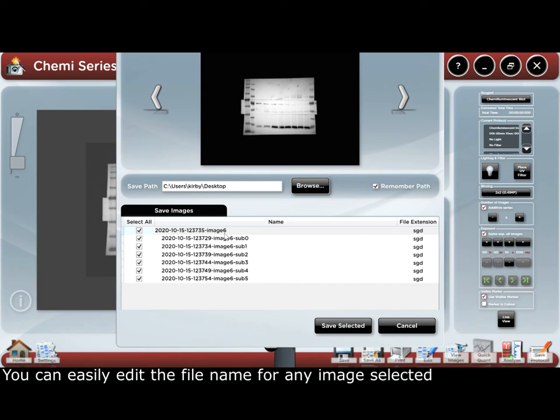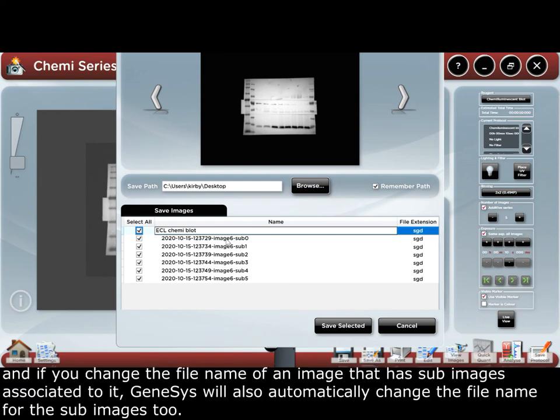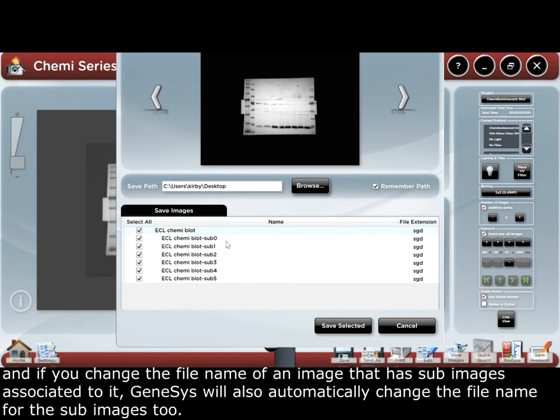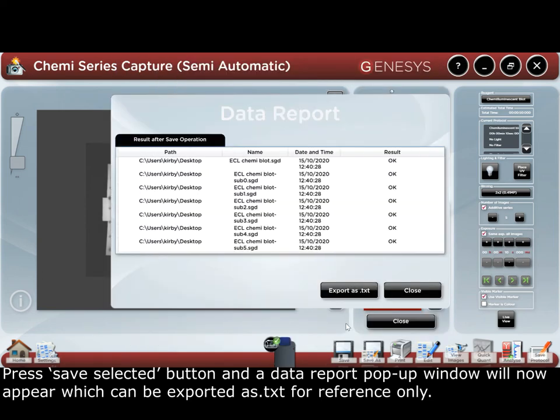You can easily edit the file name of any image selected. If you change the file name of an image that has sub-images associated to it, Genesis will also automatically change the file name for the sub-images too. Press the save selected button, and a data report pop-up window will now appear, which can be exported as a .txt file for reference only.